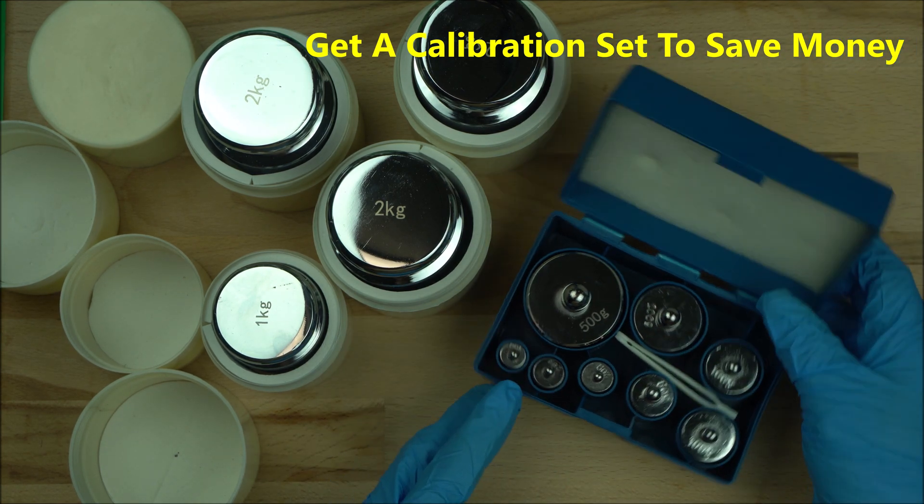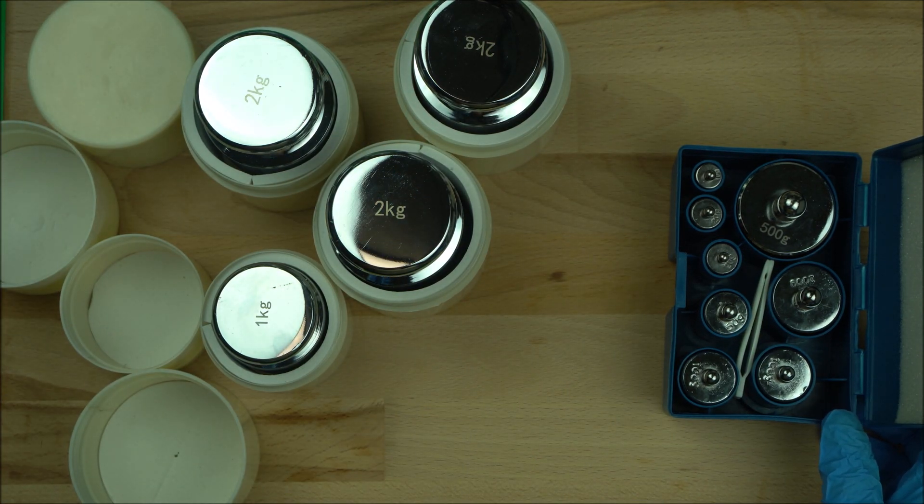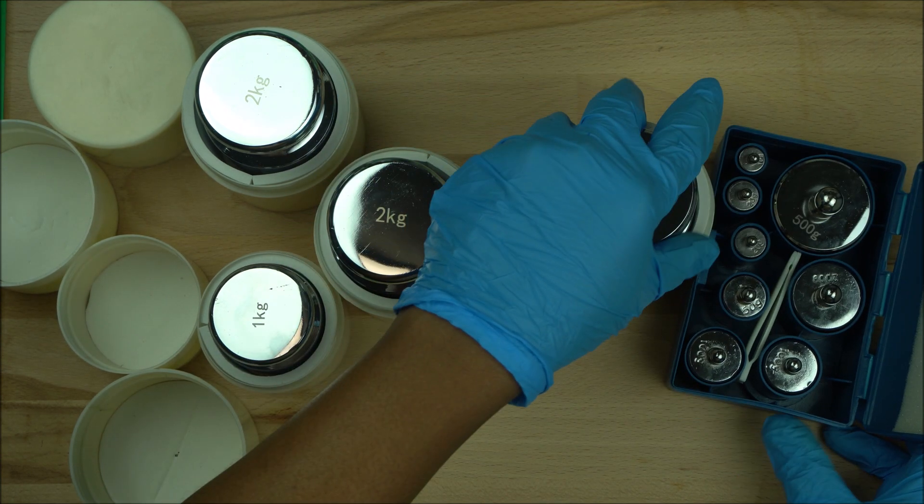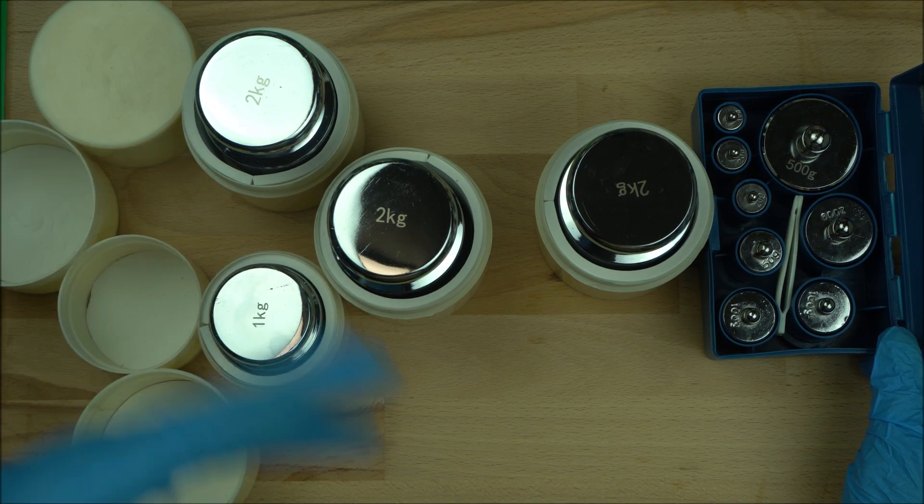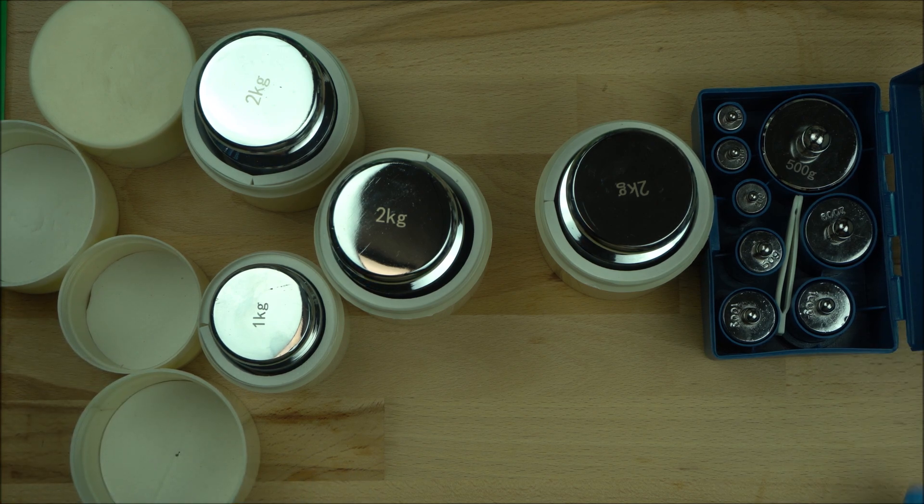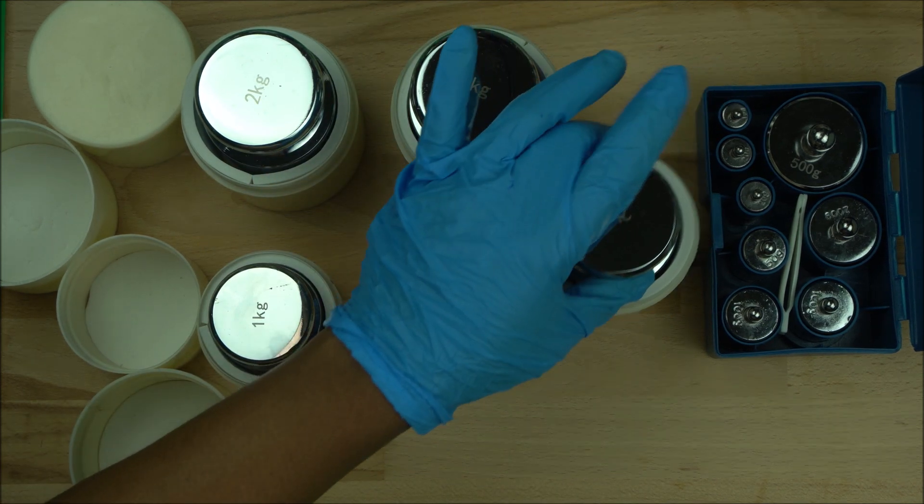If you don't want to waste your money, go for calibration weight sets—that's another way to save your money. Also make sure you check around for the best price. I found the best price, especially for those in the UAE and in the US. Now you can find a lot of amazing prices on calibration scales.